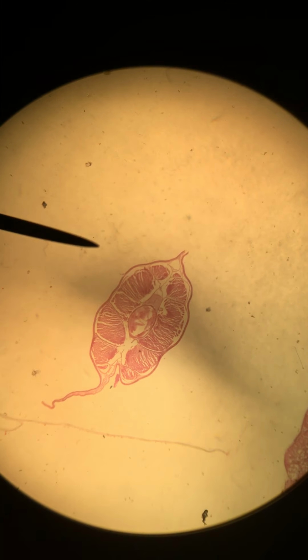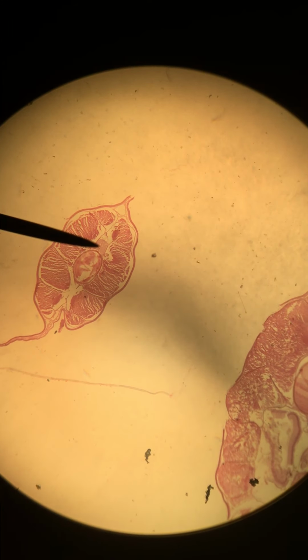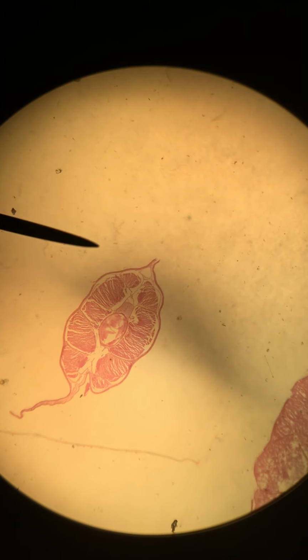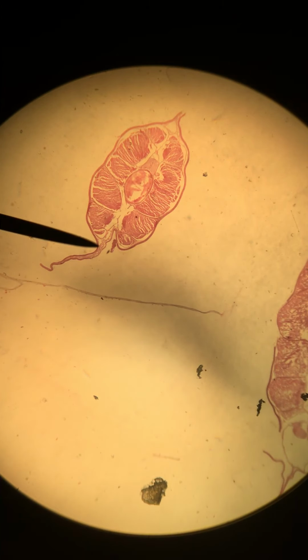Here we go. One more slice through this organism. Still have the notochord, dorsal nerve cord running the whole length of the body, myomeres, myosepta, dorsal fin, and ventral fin. And that wraps up the cross sections for the Amphioxus or the Lancelet.